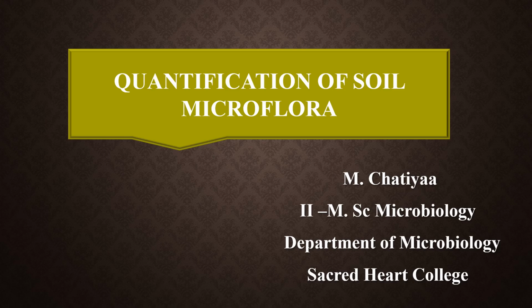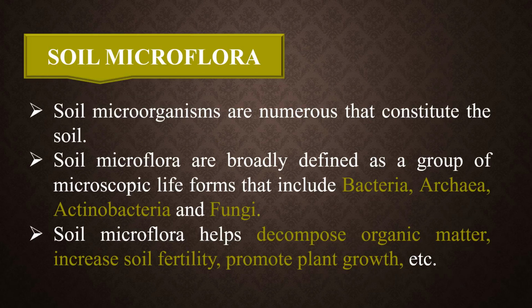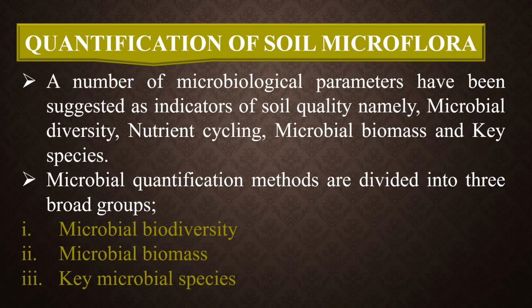In this video, let's discuss quantification of soil microflora. Soil microflora. Soil microorganisms are numerous and constitute the soil. Soil microflora are broadly defined as a group of microscopic life forms that include bacteria, archaea, actinobacteria, and fungi. Soil microflora helps decompose organic matter, increase soil fertility, promote plant growth, etc.